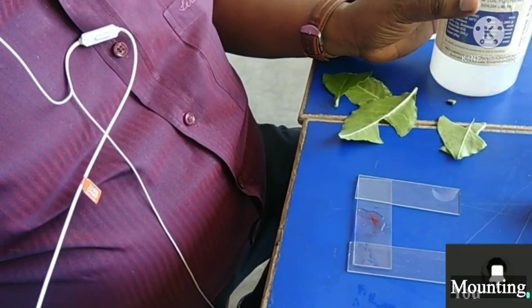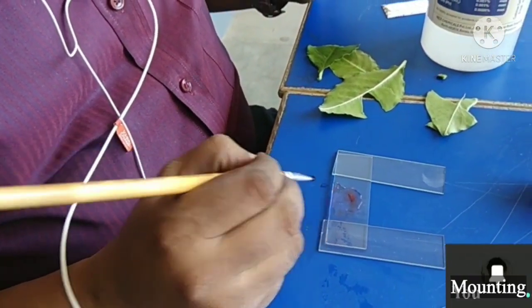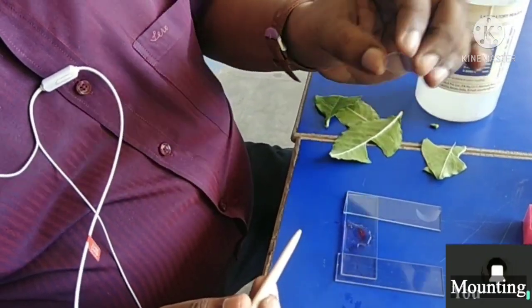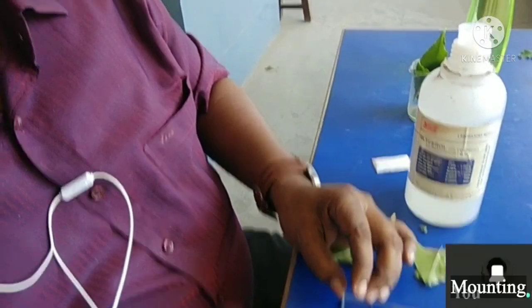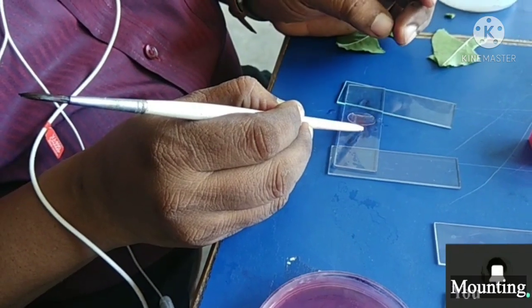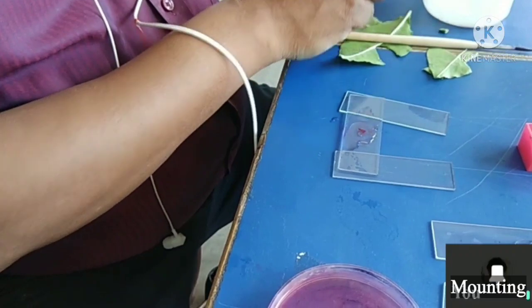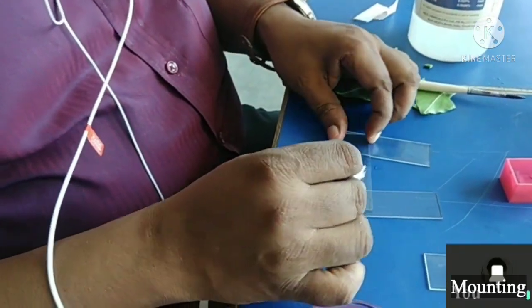Here I am taking the glycerin. We have to take a little bit more. Now look at how I am doing it — I am holding this cover glass at a 45-degree angle, and then gradually lowering it. So it is now mounted, and with the help of blotting paper the extra glycerin will be removed.